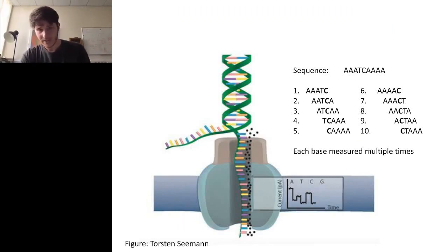And here's another view showing the same thing, but the actual sequence within the barrel of the pore is more than one base at any one time. You can see in this diagram each coloured bar represents a base, but the pore is long enough that there are multiple bases within the pore, which means that when you read off a current, you're actually reading off a DNA word, because it contains more signal coming from other bases as well. I've represented that here using this pretend sequence.